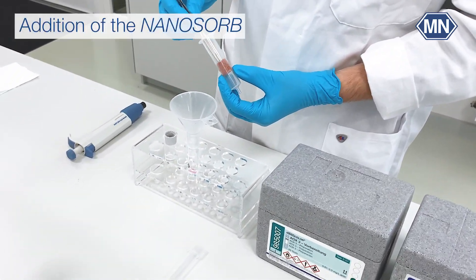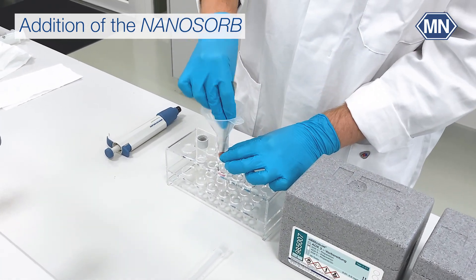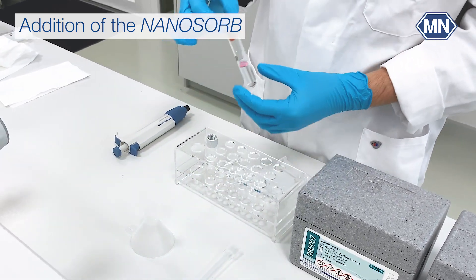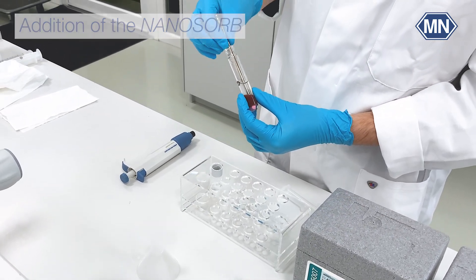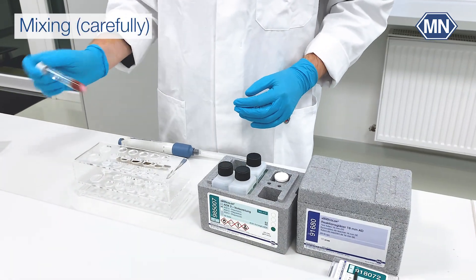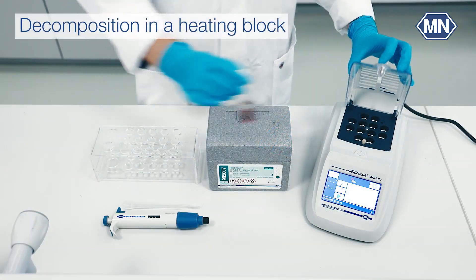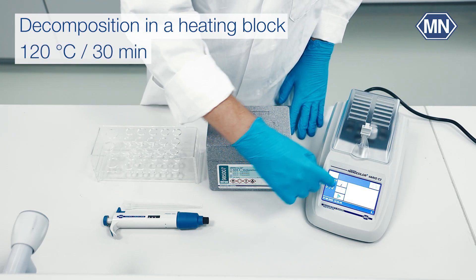Remove the Nanofix R3 from the cartridge and carefully push it to the bottom of the test tube. Make sure that the thread is dry so the tube is sealed tightly. Shake the tube gently, making sure that the Nanofix R3 remains at the bottom. Place the tube in the heating block and set it to 120°C. Allow the heating program to run for 30 minutes.